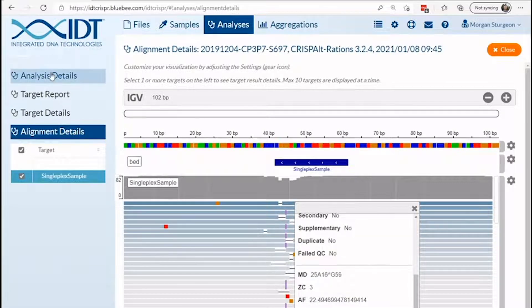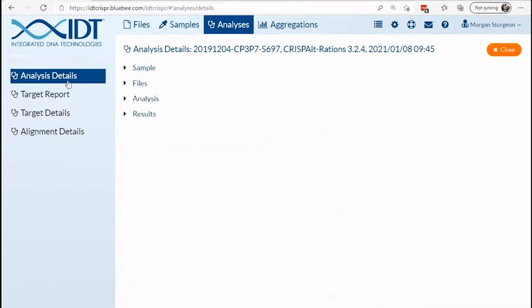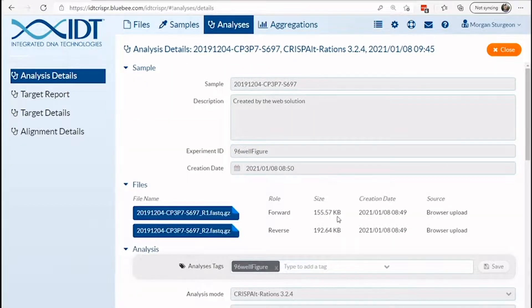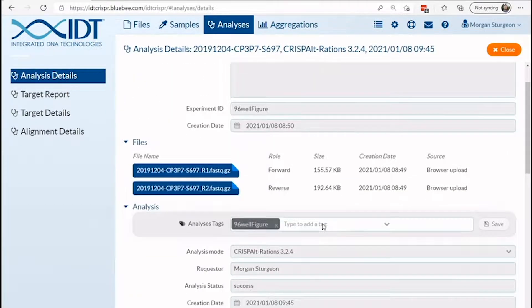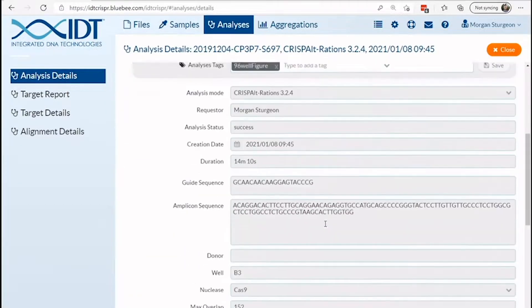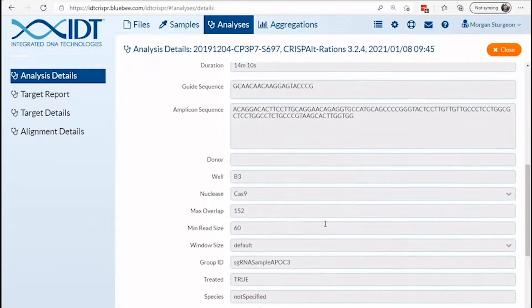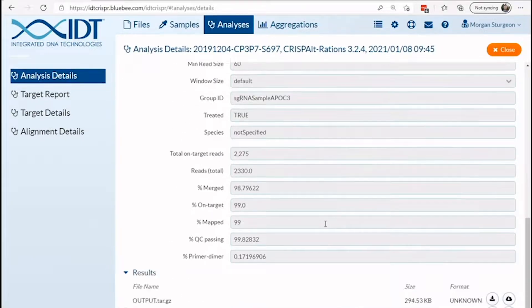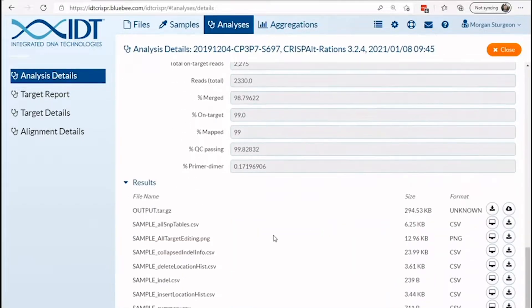For end users with novel graphical needs, you can use raw data to render these graphics. These can easily be downloaded by clicking on the analysis details page. From here, you can see general sample information as well as an assortment of files that can be viewed or downloaded for custom needs.